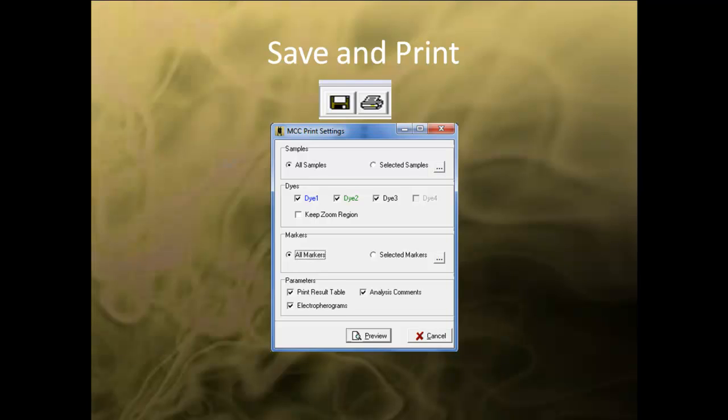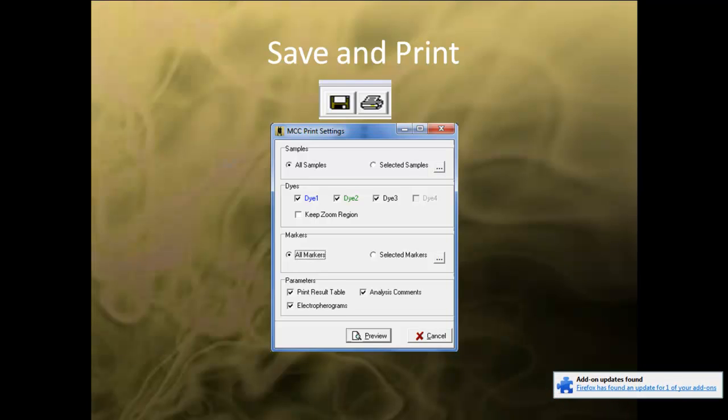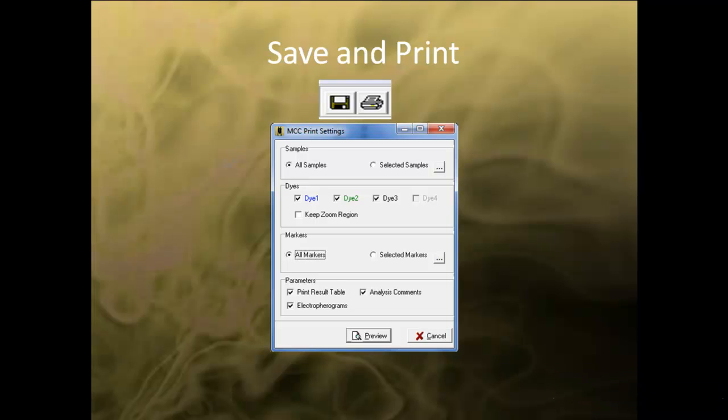From the results window, you can save the report by clicking on the save icon in the toolbar. Clicking on the print icon brings out the print settings dialog box. You can choose to print all samples, individual samples, markers, or dyes. If you want to print a specific region, zoom into the region of interest and select Keep Zoom Region in the settings dialog box.